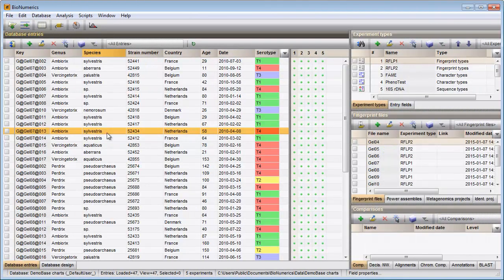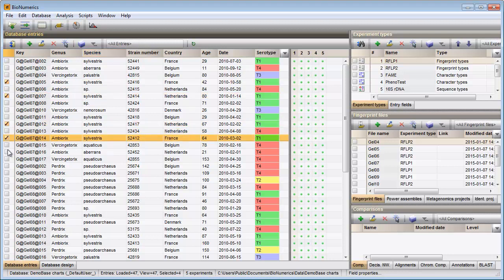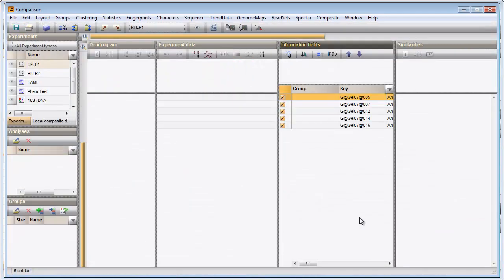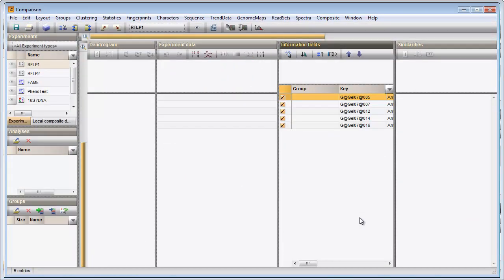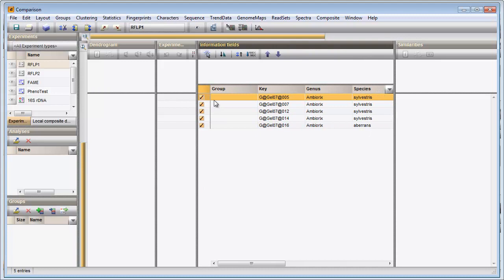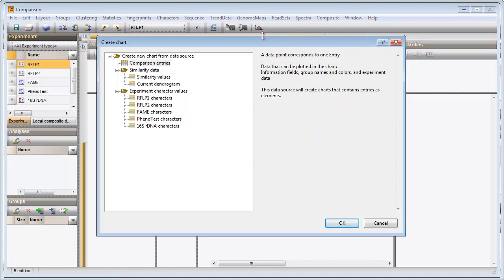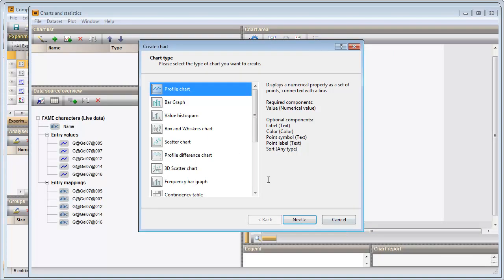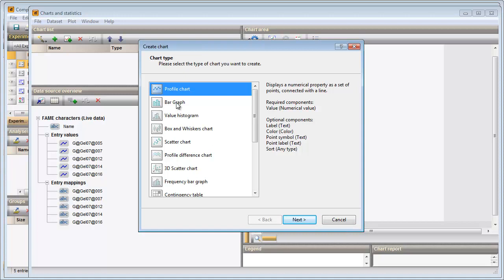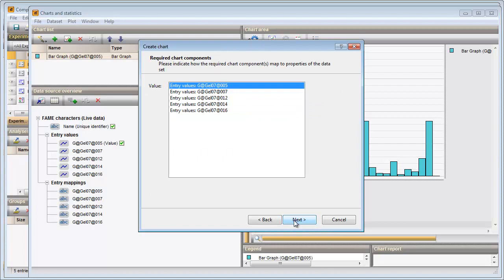In this example I will create a bar graph displaying the character set of a selected entry. I first select a few entries in the Database Entries panel using the checkboxes on the left. I will create a new comparison by pressing this button in the Comparisons panel. The selected entries in the main window are loaded in the Comparisons window. I call the Charts wizard and select the FAME character set from the list. I choose the bar graph option and choose any of my selected entries in the next step.